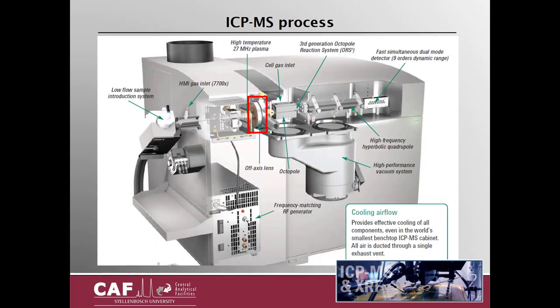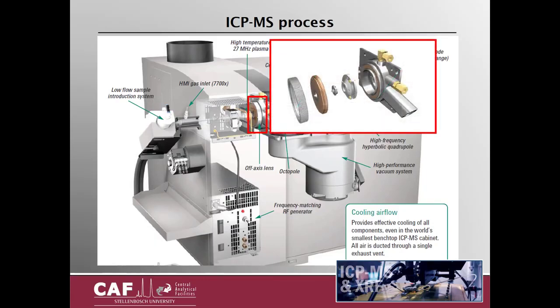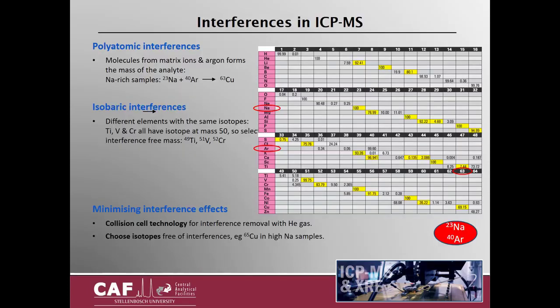In the argon plasma, every single element in your sample has now been ionized, from the analytes you are interested in, along with all the matrix elements. This soup of ions is then sucked through a set of metal cones with 1 mm followed by 0.4 mm opening. All the neutral species and light photons are rejected and do not continue further into the instrument.